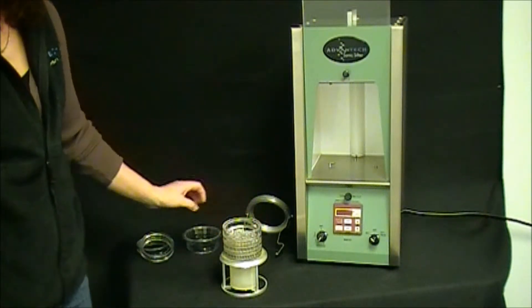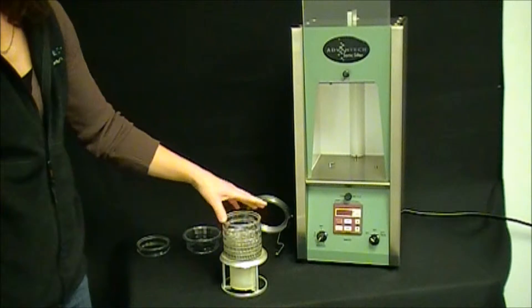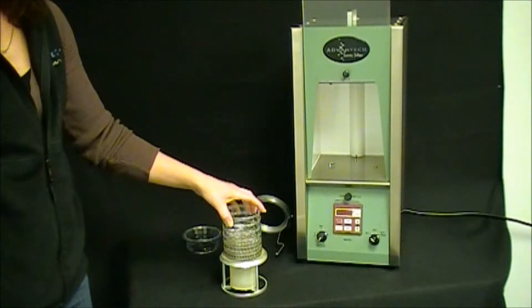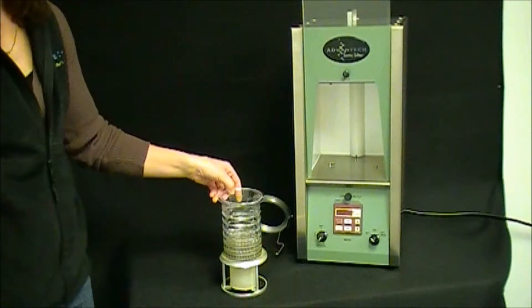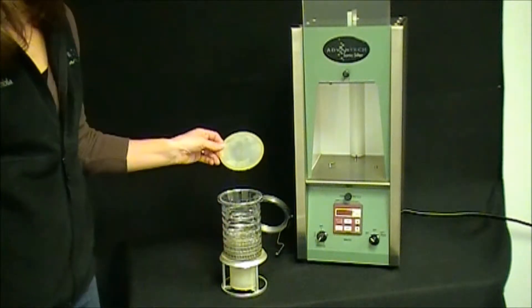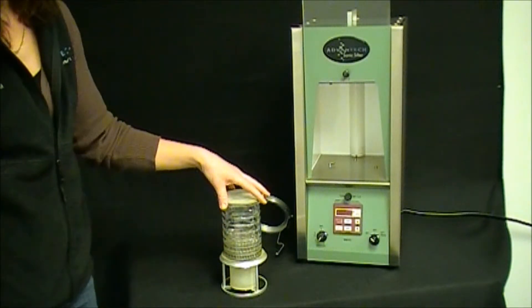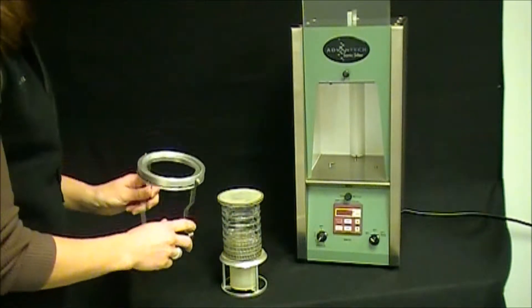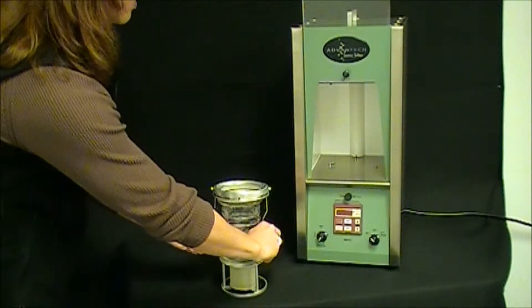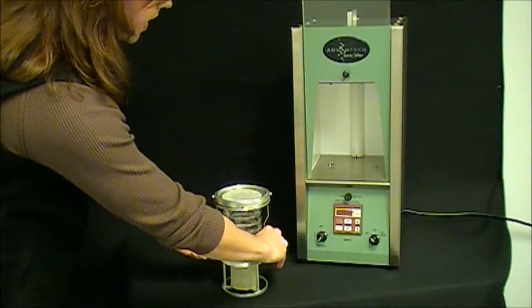If necessary round the stack out with sieve spacers and add your top cone. Top with the diaphragm and lock the entire assembly together with the column lock.